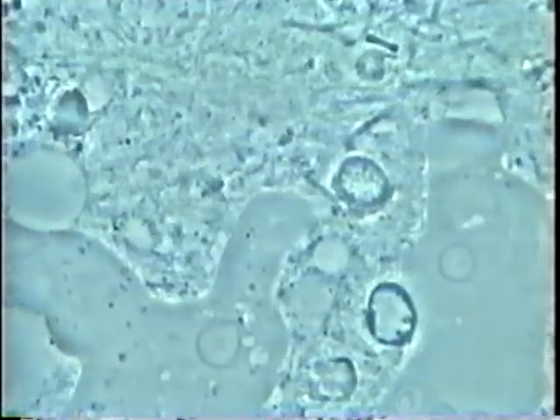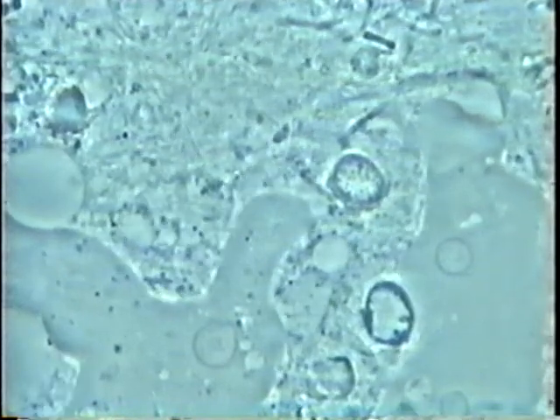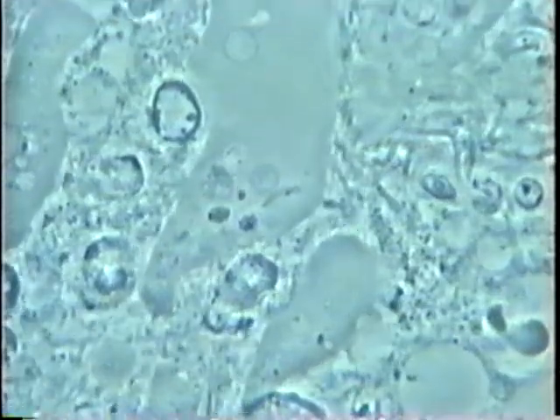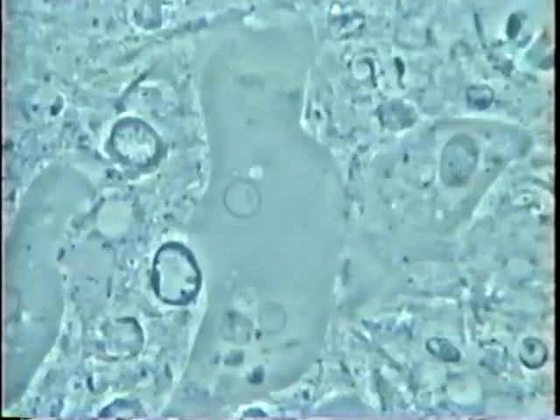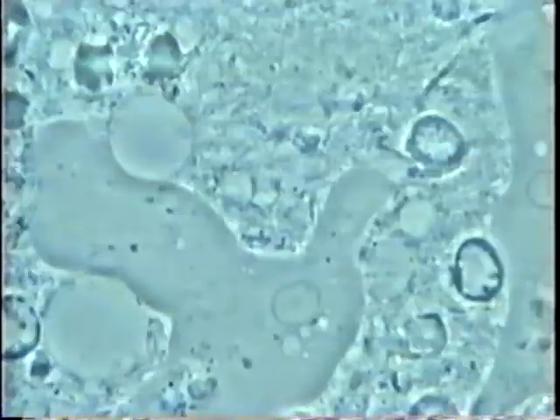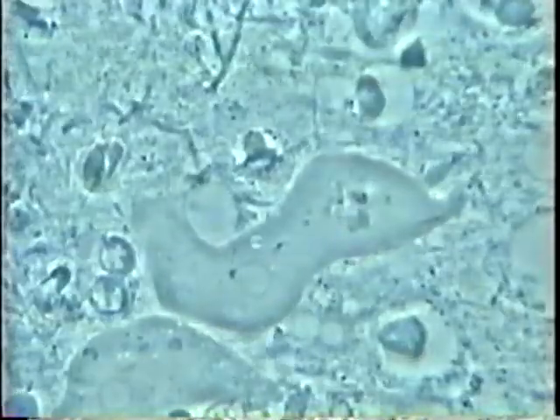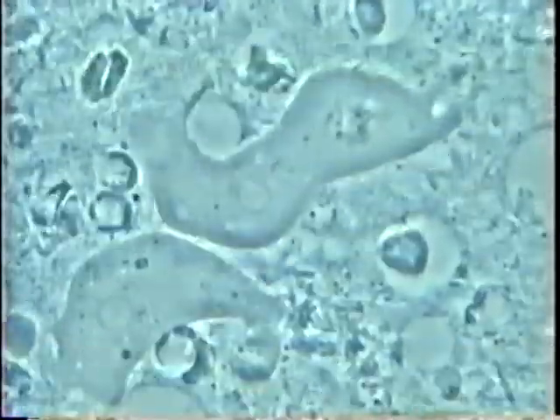Here we see gum disease with active biofilm. We see many bacteria, spirochetes, motile bacteria, and we see here two amoeba, a third one, a small one — they're going up, traveling and looking for their prey. We see some white cells, some denucleated white cells which have lost their nucleus.